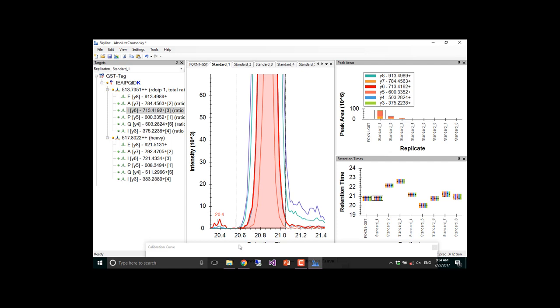Oh, okay. So this nice little view that shows you the background, my son did this last summer as an intern. All you have to do is select a transition, and that will give you this shaded view.